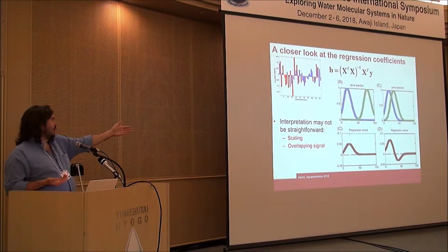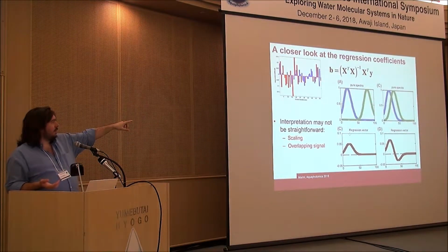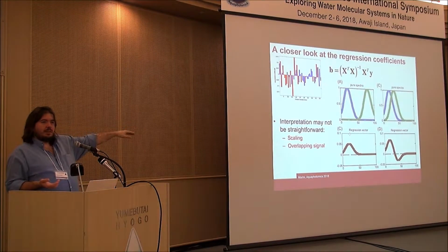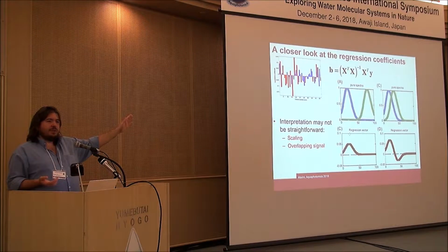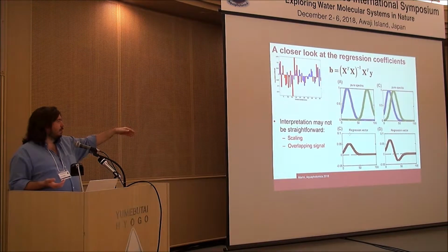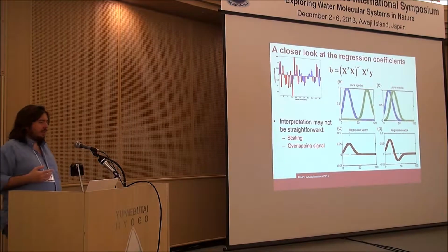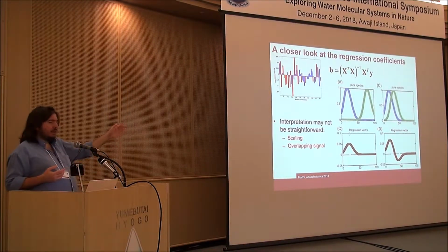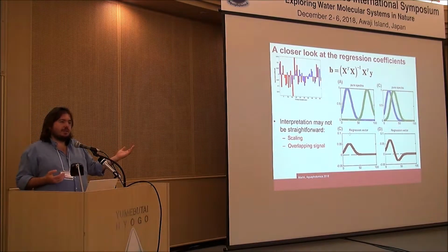And you see it here with this toy example, when we are interested in the blue analyte. Of course, when we have interferences that we are not interested in but that are distant in the spectral wavelengths, then the regression coefficient is not affected by the presence of the interference.